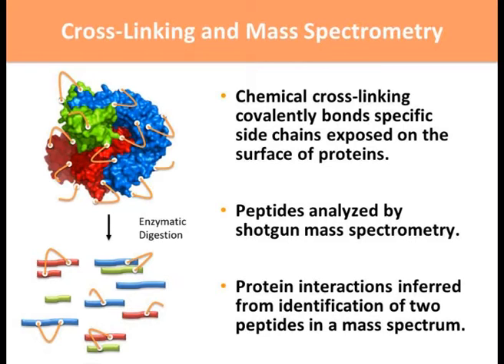And I'll go over that in a moment, but these cross-links create tethers that then bind when they pass between two of the protein subunits in the complex, such as this blue subunit here on the outside and this red subunit tucked in the middle here. These tethers create a covalent bond that, after digestion with your trypsin, those peptides remain linked together.